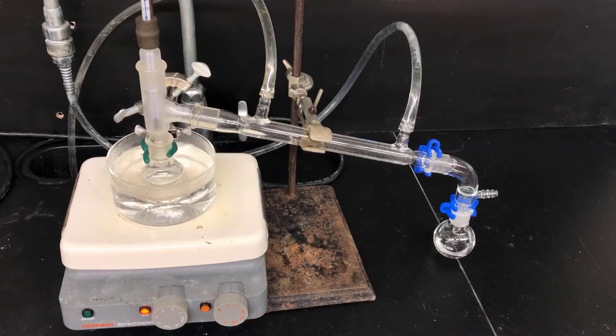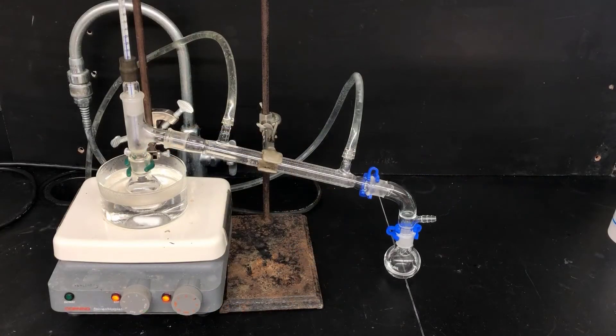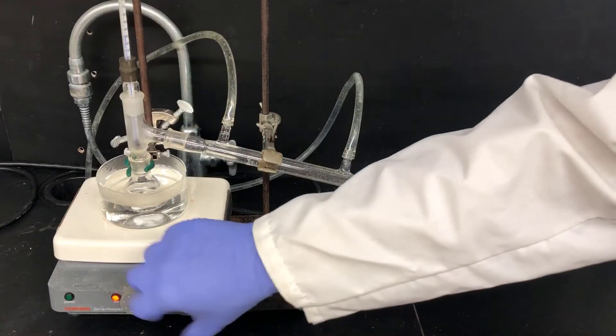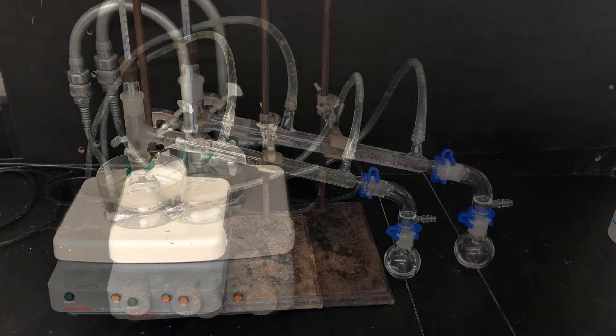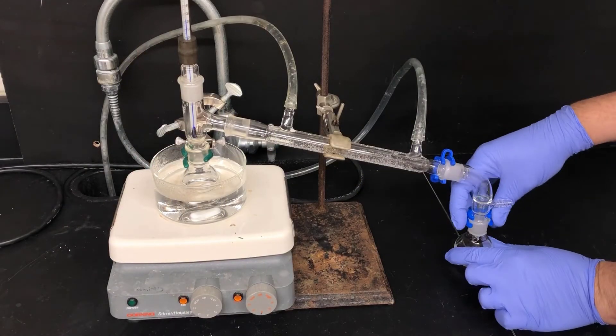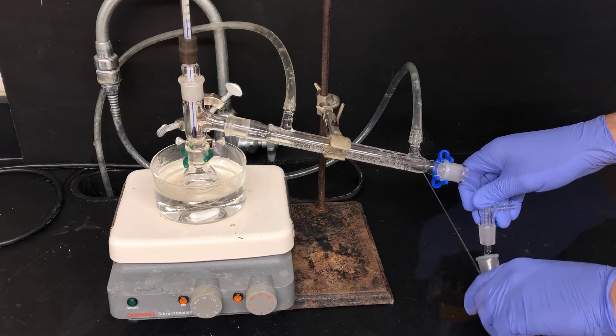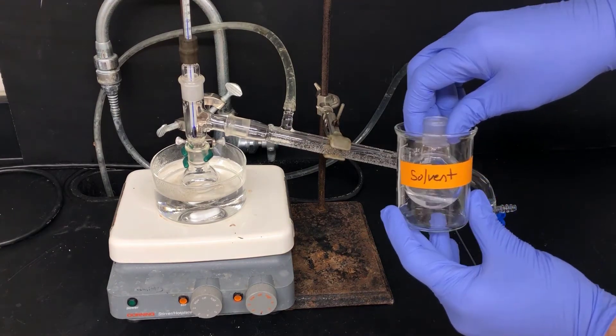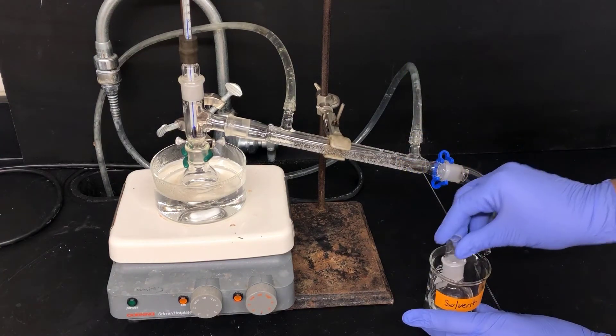And you'll also notice the bubbling in the distillation flask on the left stopping. At this point, the distillation is complete, and you can turn off the heat and the stirring. Now just to make sure there's no confusion, I'm going to take off the collection vessel here and put it in a beaker labeled solvent. And I'll cap this flask, because the solvent is quite volatile.